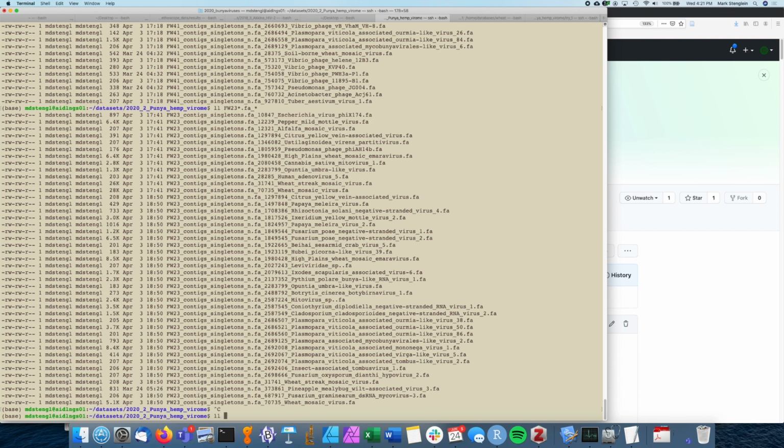Let's have a look at what happened with the pipeline. The way I'm going to do that is I'll do ls -lrth fw23*.fsq.